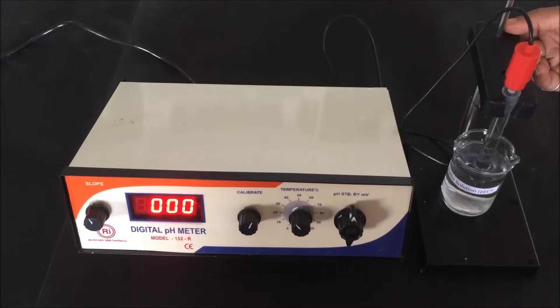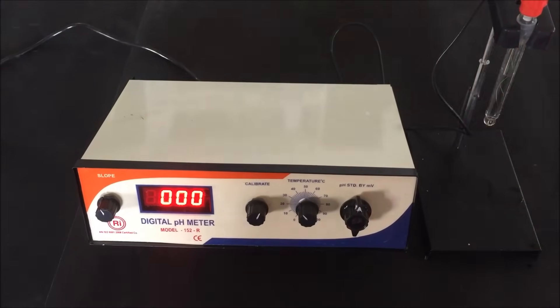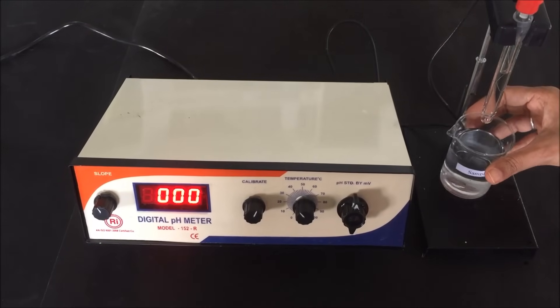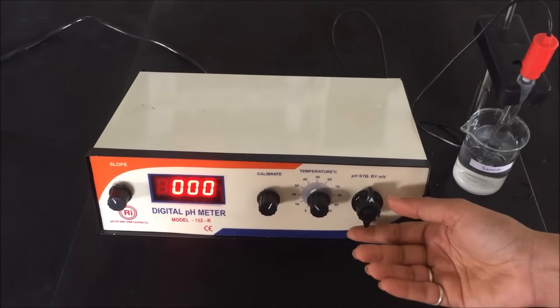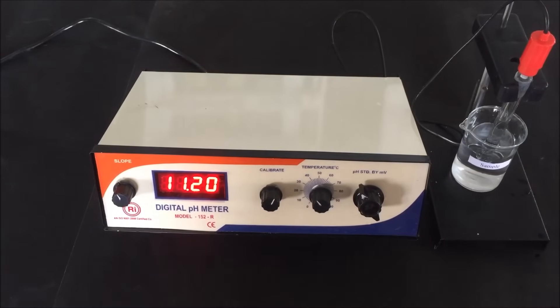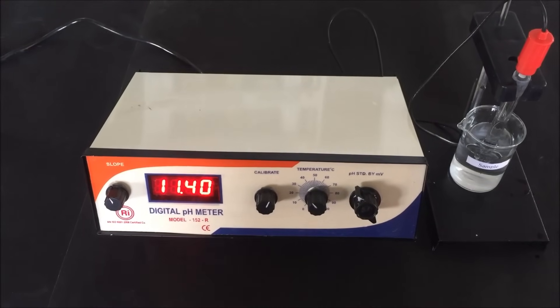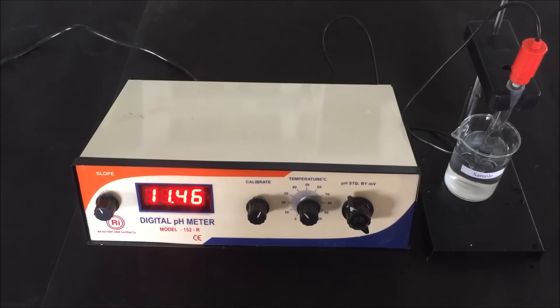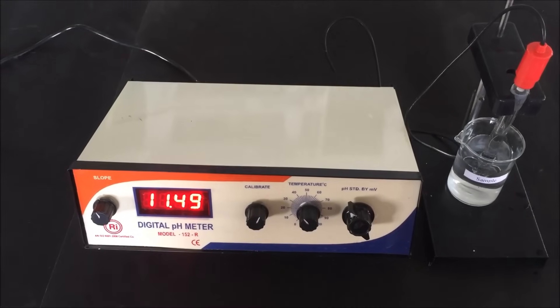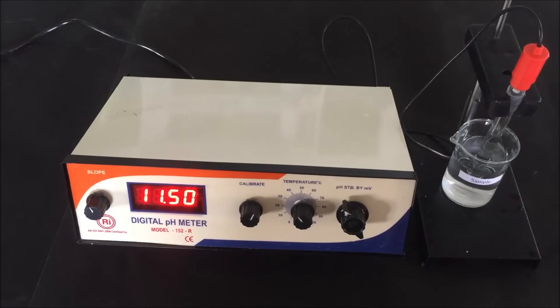Rotate the knob to standby mode, remove the electrode from the standard buffer solution, rinse it with distilled water, and dry it with tissue paper. Now dip the electrode into the sample of which we have to measure the pH, then set the function knob to pH mode. Allow the display to stabilize before taking the reading — wait until the display reading becomes constant. Remember: once calibrated, do not disturb the calibration or slope knob while taking measurements. After every use, rinse the electrode with distilled water and place it back in the storage solution, which is KCl. The reading becomes constant at 11.50, meaning the pH of our sample solution is 11.50.